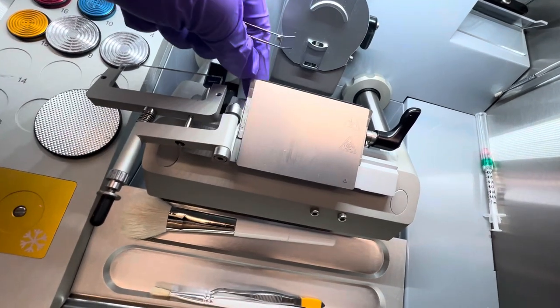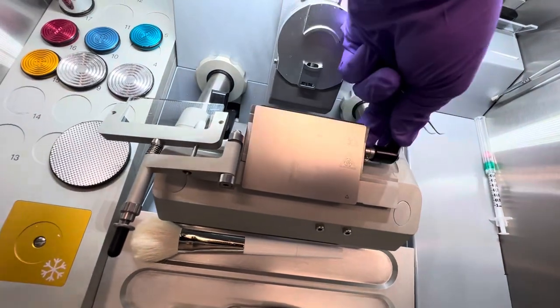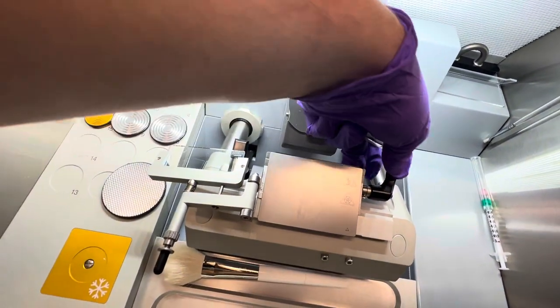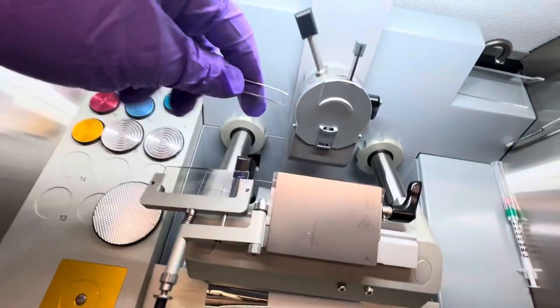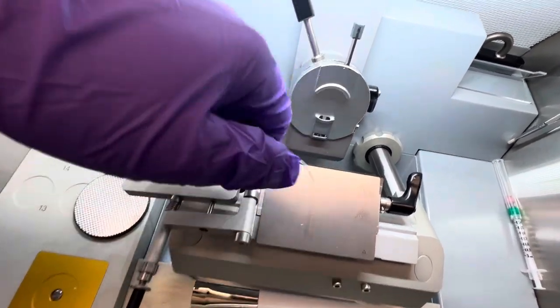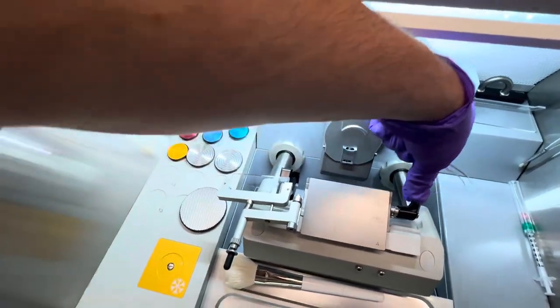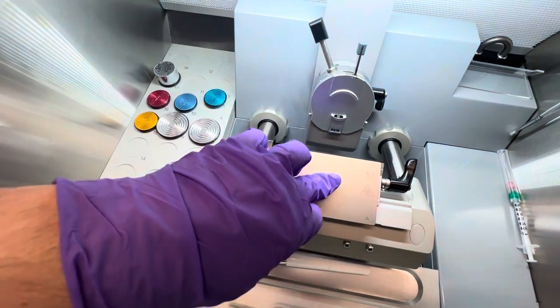Nope, see, it's not secure because it's moving around. So I'm pushing down on the clamp here. And now, nope, not moving. It's good to go. So push down on the clamp like so, this way. I was pushing in the wrong direction. It's a bit confusing when you're holding the camera too. But pushing down the clamp will keep it secure so that this doesn't move.